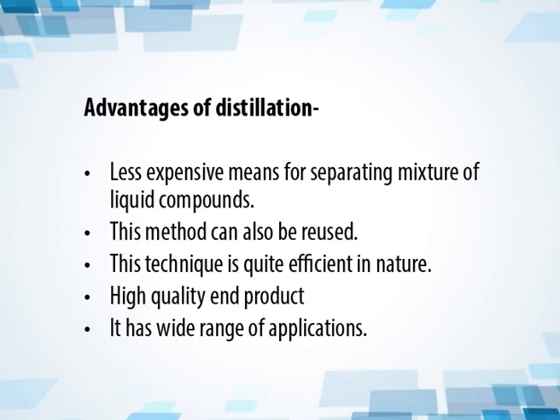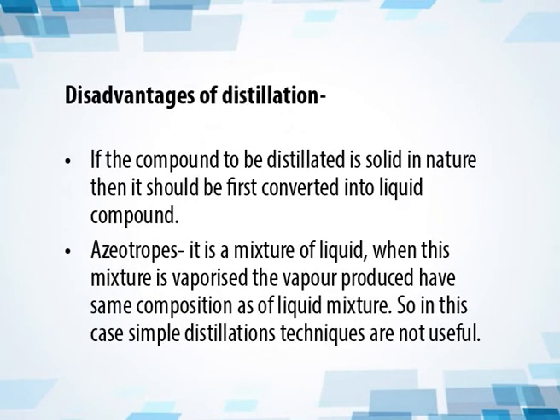Starting with advantages of distillation method. These are less expensive methods for separating mixtures of liquid components. This method can also be reused. This technique is quite efficient in nature and high quality end products are expected. It has a wide range of applications. With this, now let us move to the disadvantages of distillation method.